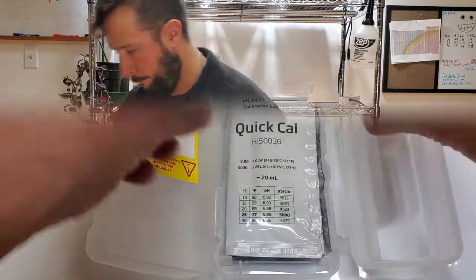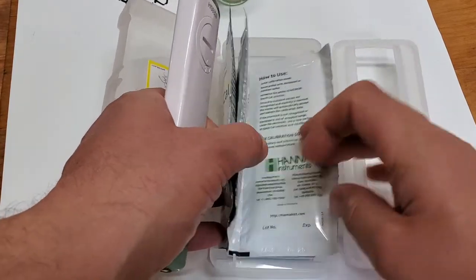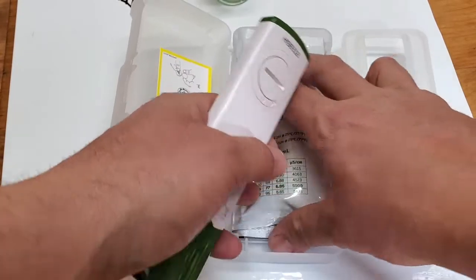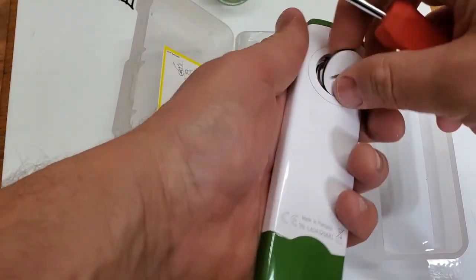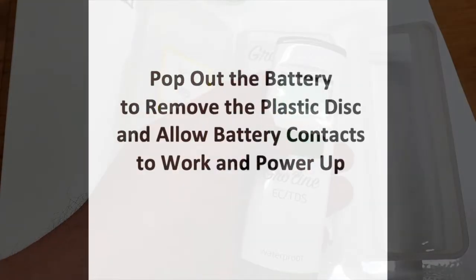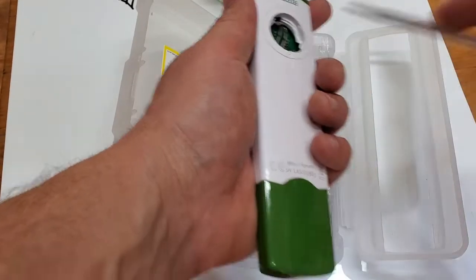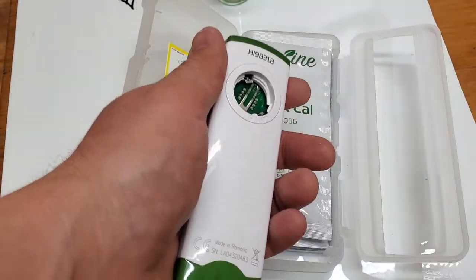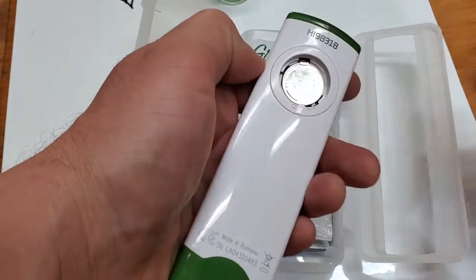We've got a battery warning indicator, a quick cal solution, a couple of those, and some cleaning solution — actually just a bunch of quick cal. Open it up. You've got to pop the battery out first to get the little battery protector out of there, then pop it back in.